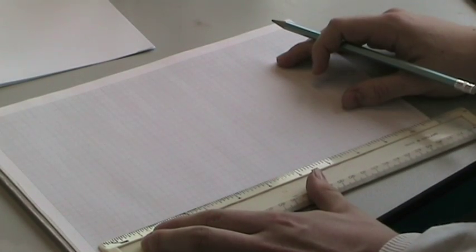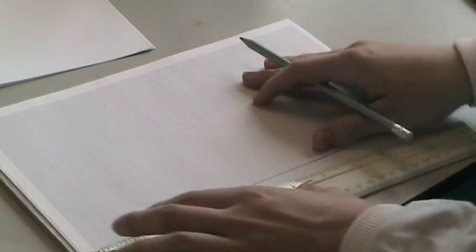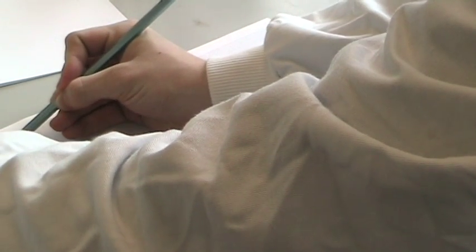I'll now illustrate what to do with the O2 consumption data. I'm drawing the graph from scratch, but you'll use class data in Excel.